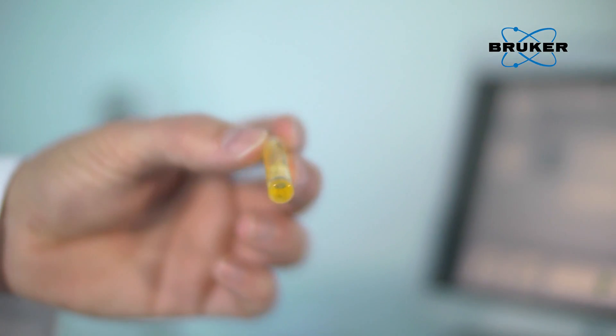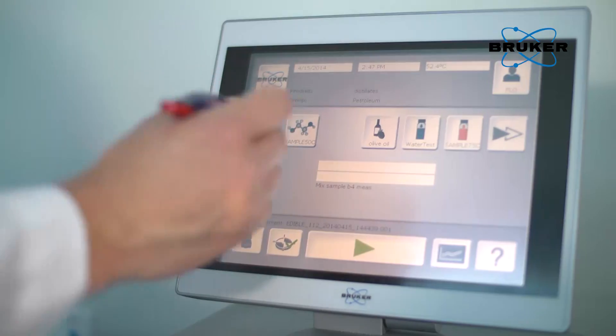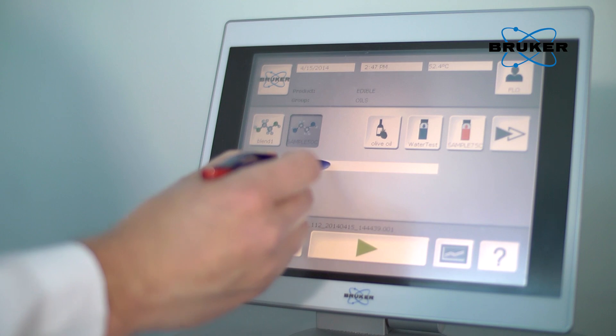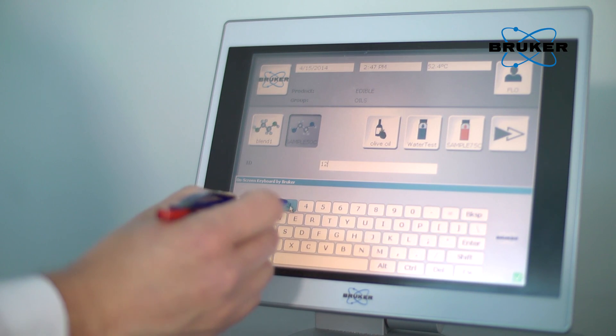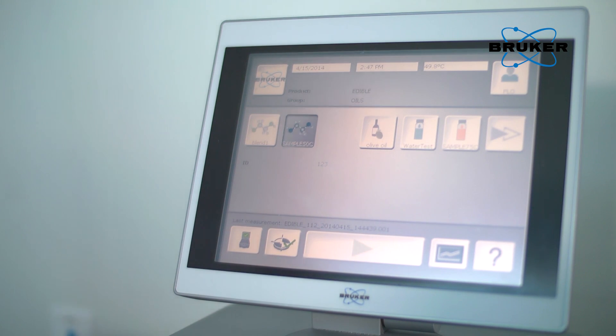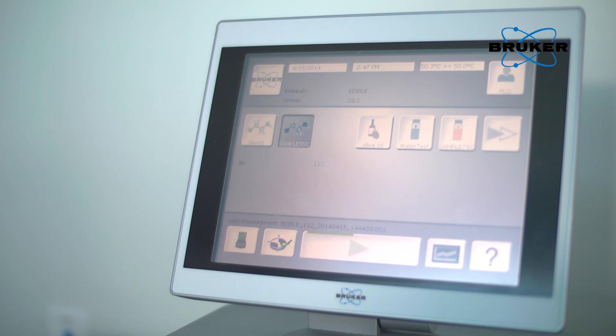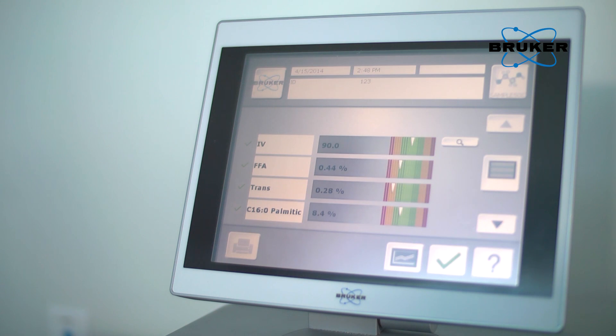The sample is simply filled into the measurement cup or sample vial and placed onto the spectrometer. The product is selected by either pressing on the respective product icon or by using a barcode reader. A simple touch on the screen starts the measurement. The progress is displayed through the green status bar. After approximately 15 to 30 seconds, the measurement is complete. The result view shows the quality of the analyzed product immediately.